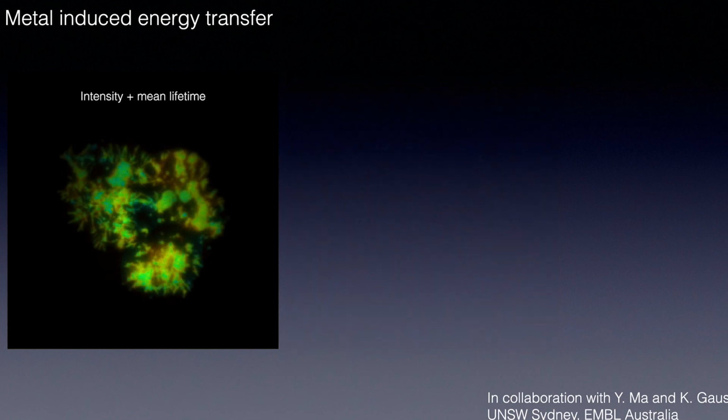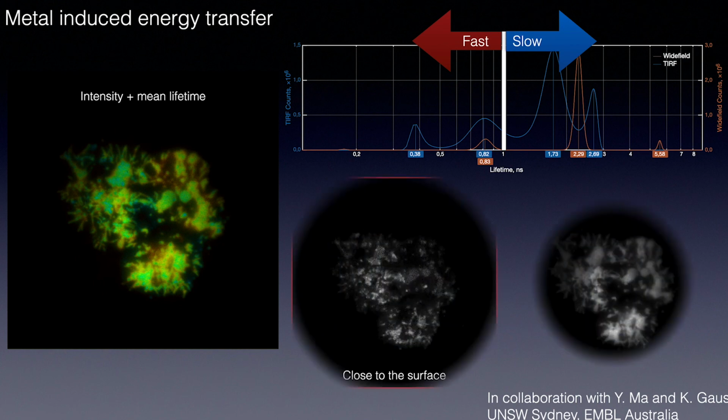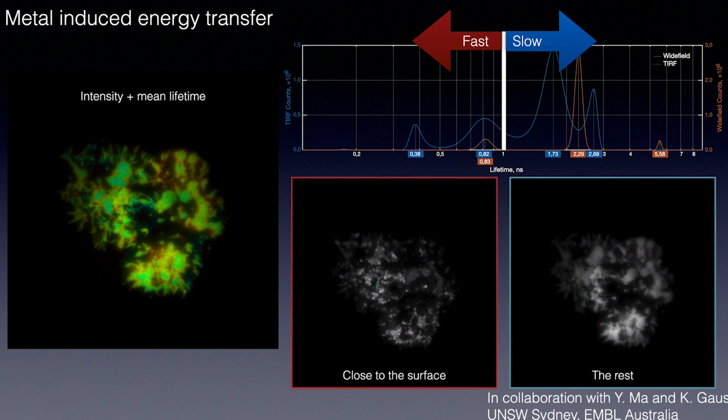This is an intensity-weighted mean lifetime image. Here we performed maximum entropy-like analysis, defining the edges between slow and fast lifetimes that correspond to more or less quenched molecules. We can do mixture resolving of the molecules that are close to the gold surface and those that are distant. Thus we trade timing resolution for axial positional super resolution.